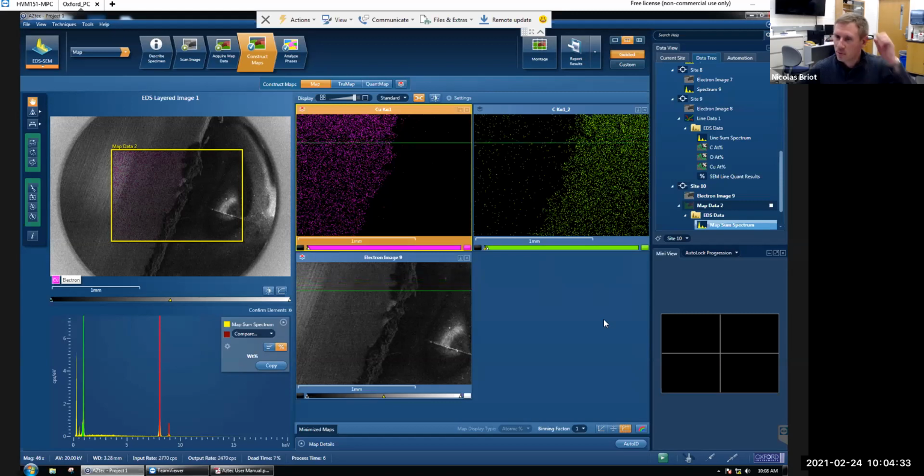Should we take a couple minutes break and then we'll just continue on your samples? Does that sound good? You're muted. What time is it? That works for me. Okay. Let's take 5 minutes, so until 10:10, and then we'll move to your samples, and we'll do EDS, the same thing we've been doing, line scans and maps, and try to see what's what.